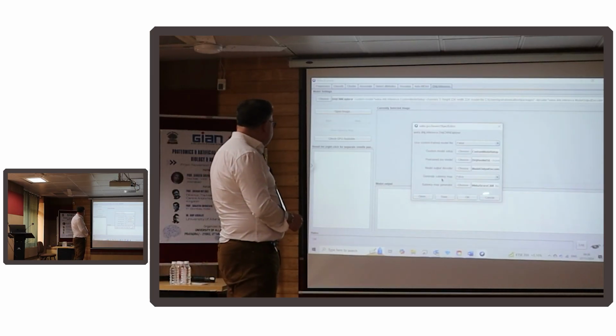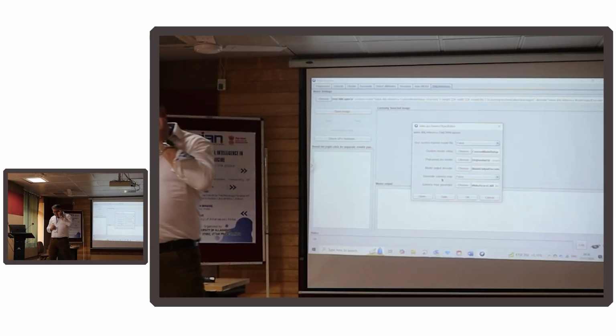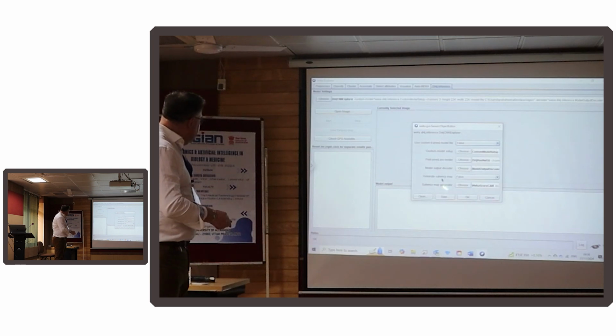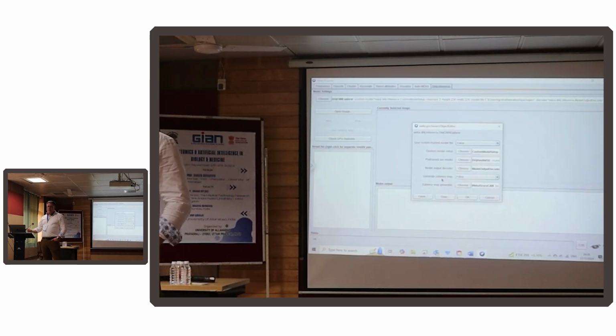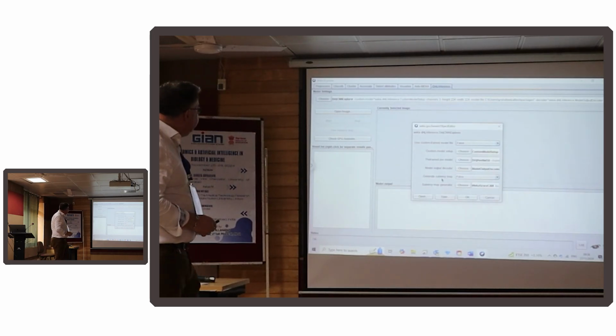I basically have pre-trained zoo models, which set up some weight settings that are good for image analysis. I've got a model output decoder, which will give me the convolutional layer components and predict something. And then I can just run it.